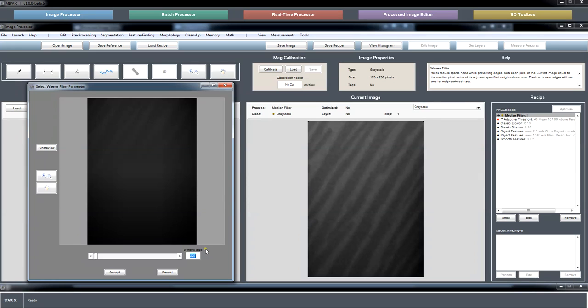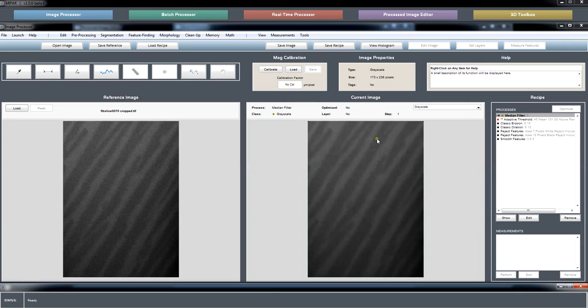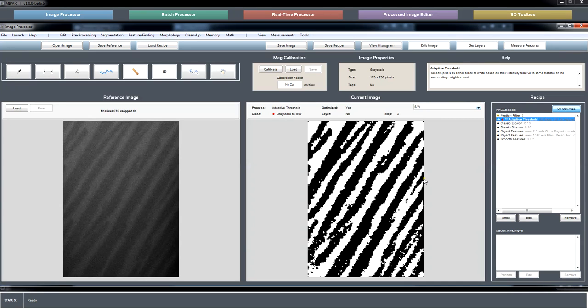You're never going to be up that high. The max value is the max dimension of the image, but with this kind of filter, you're almost always down under 10, so that range needs to be adjusted. So that's another approach to pre-filtering some of the noise. And then you're going to go with some kind of thresholding step.